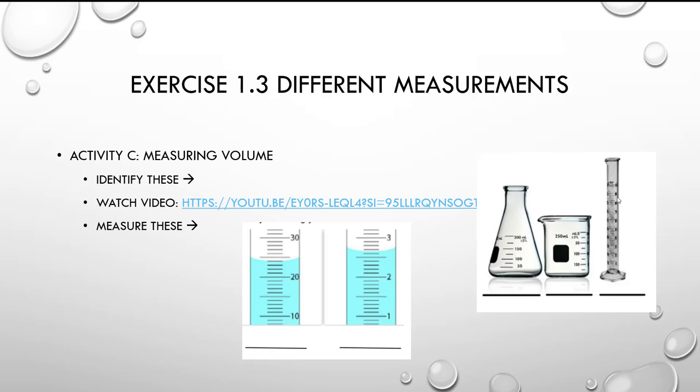So this here is what we call a graduated cylinder. One way that you can remember graduated cylinder: remember those little caps that you wear when you graduate from high school? It kind of looks like this down here, right? So think of that as a graduated cylinder. You got the graduation little cap down there, okay? That's there to measure something more accurately.